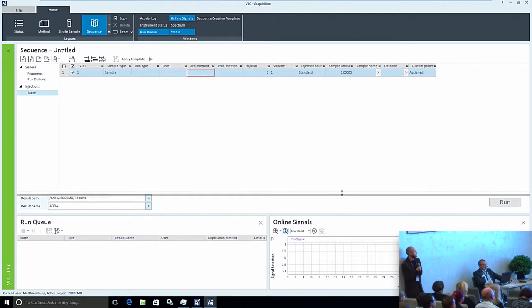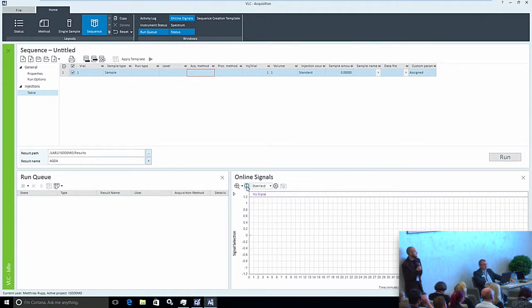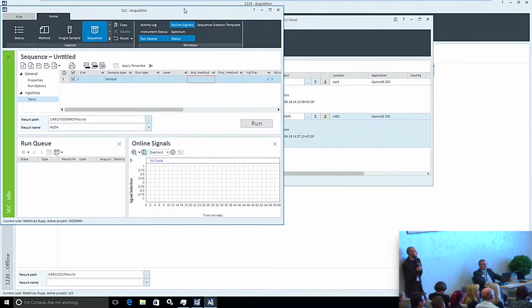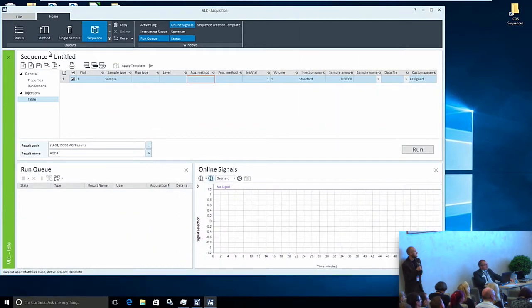You see that I can simply move the windows and I can rescale the windows as I want. You can, of course, even resize the windows to your needs. And the bigger the screen, this is a big one, the better the experience is.